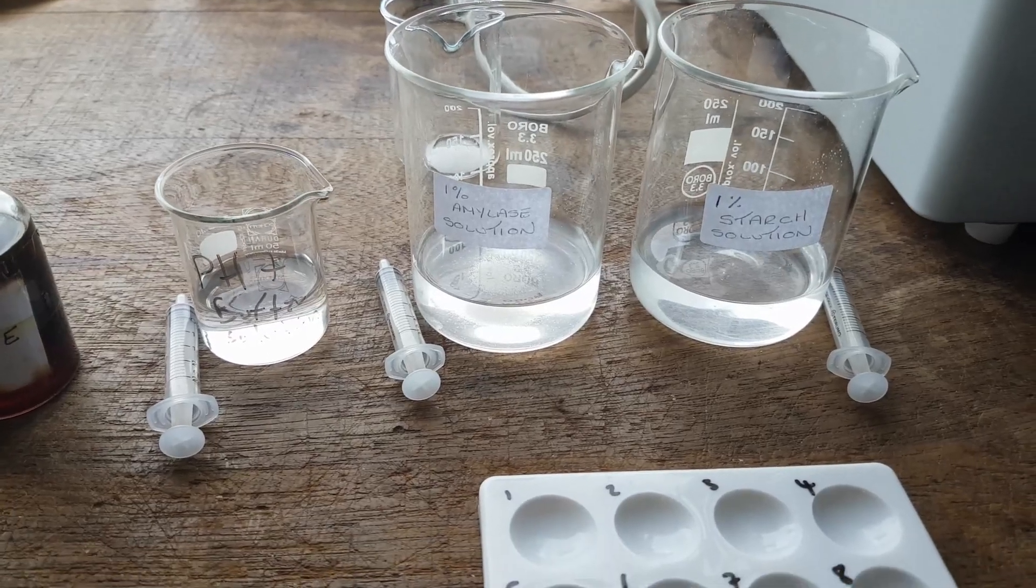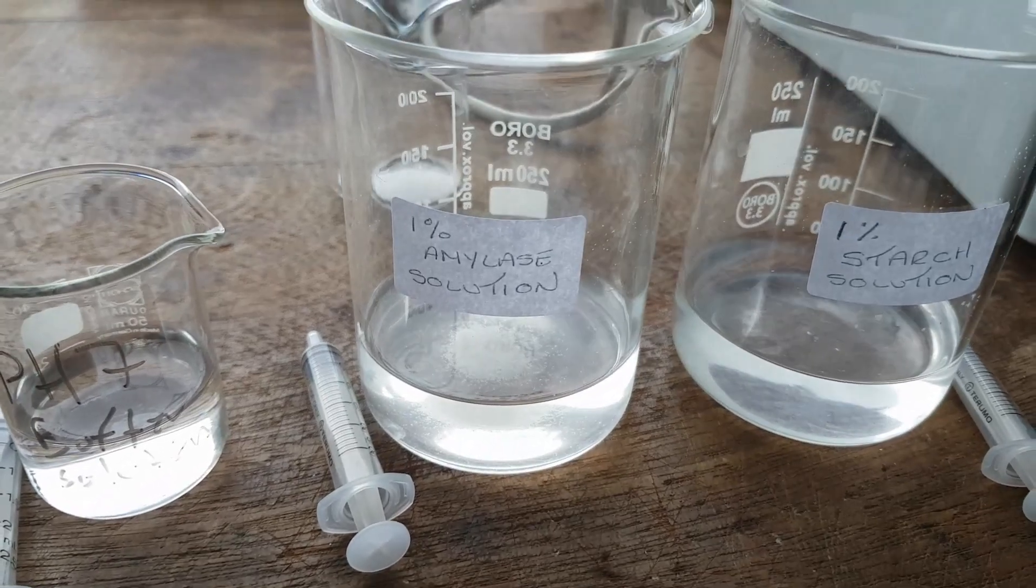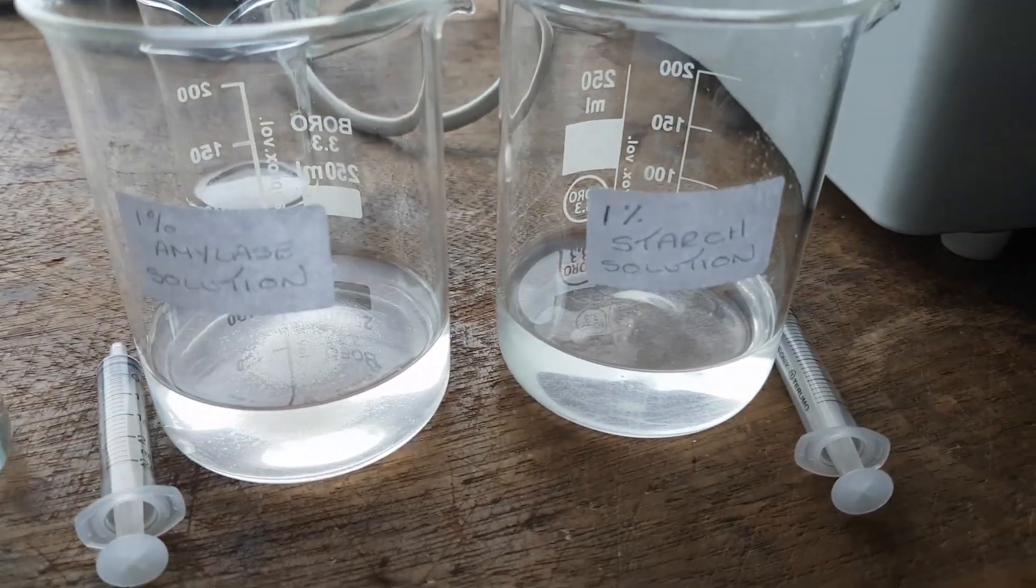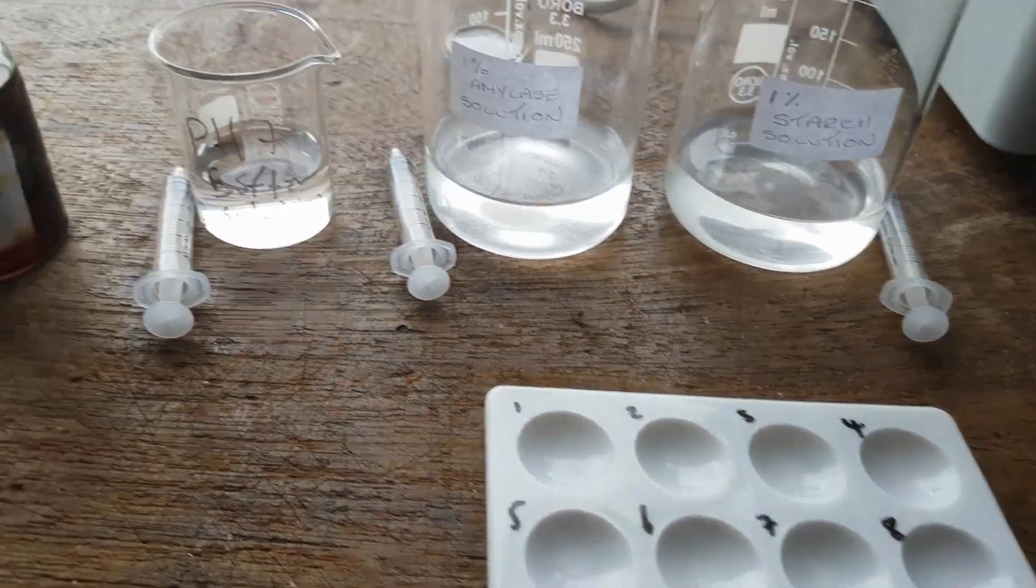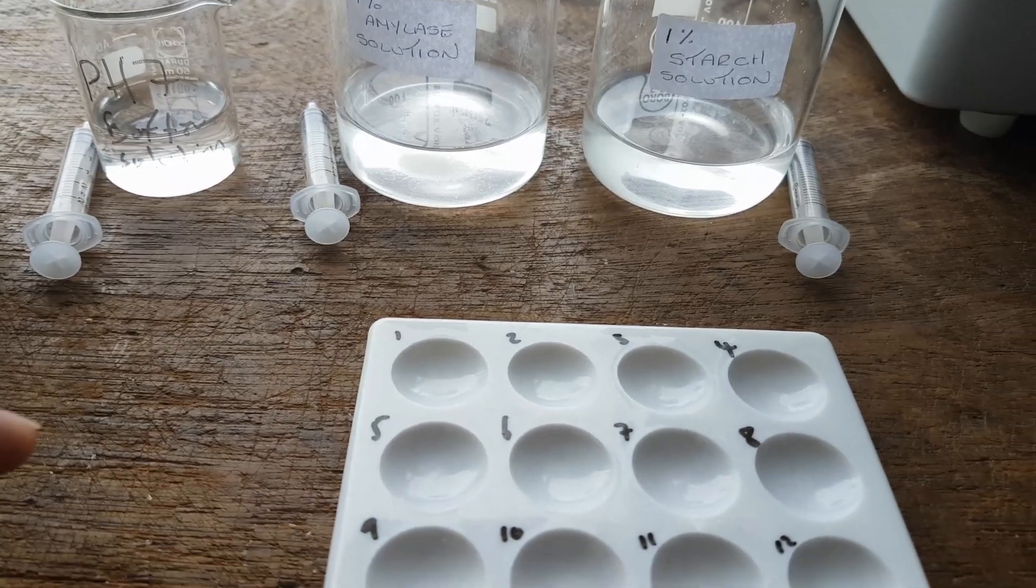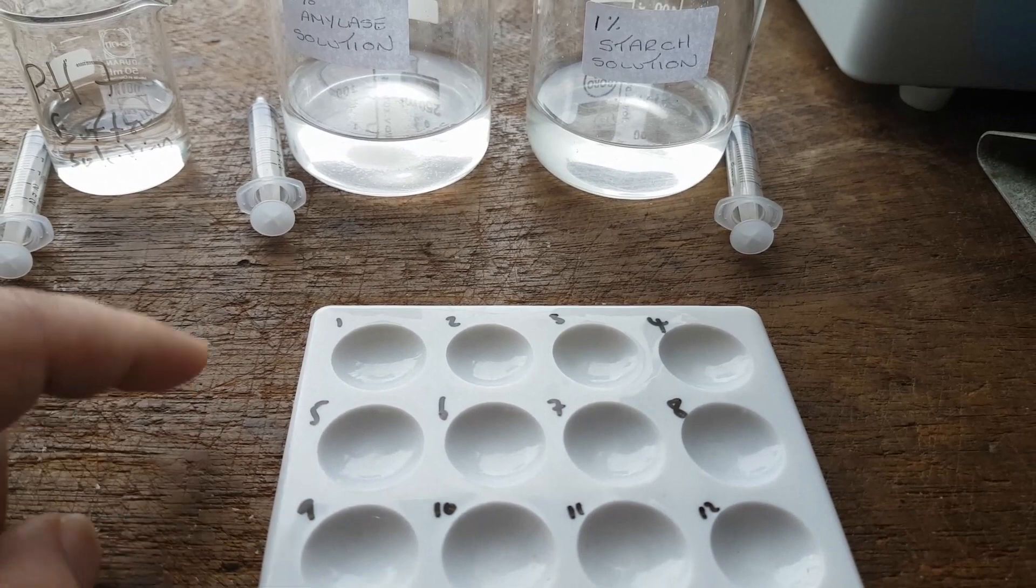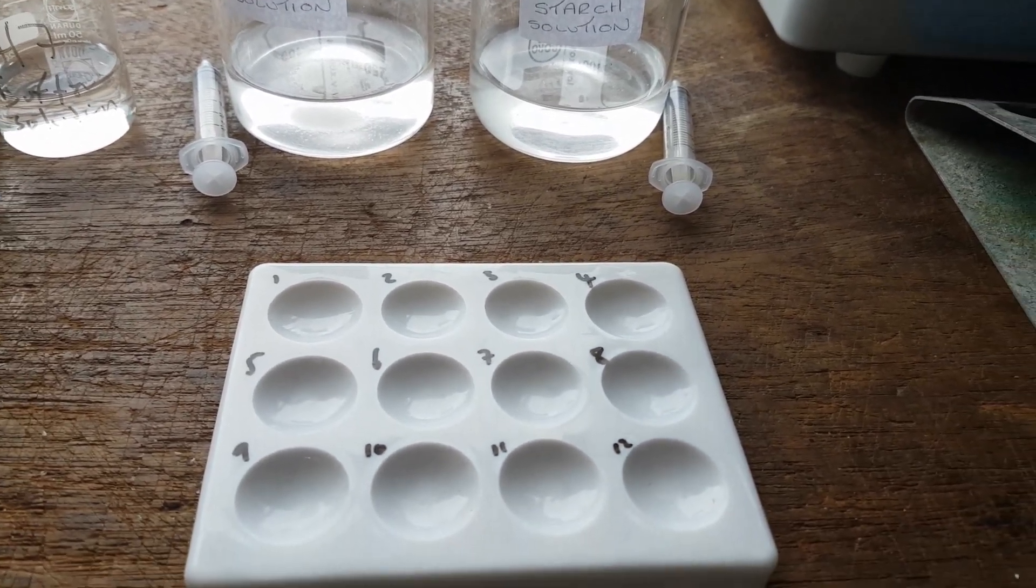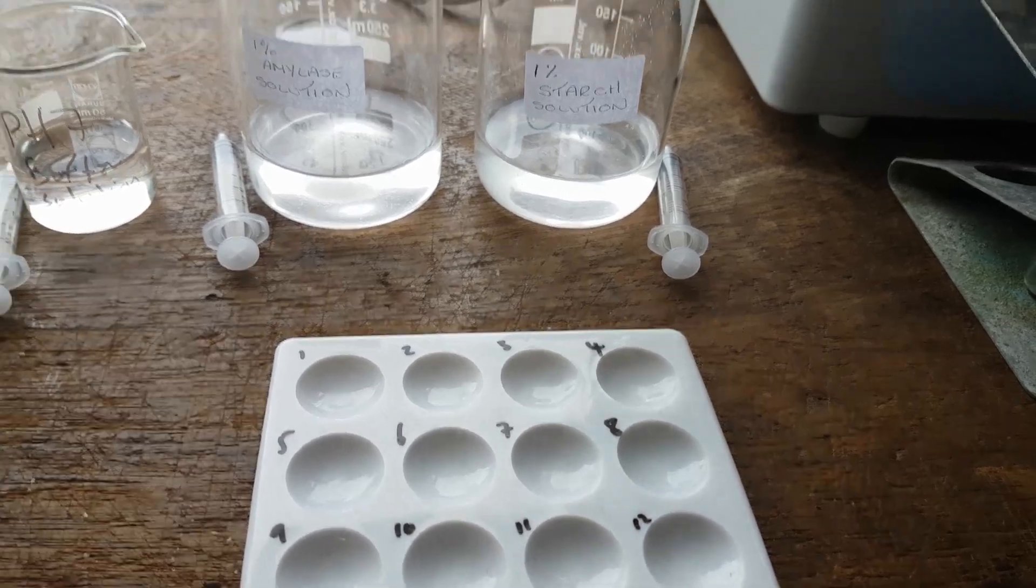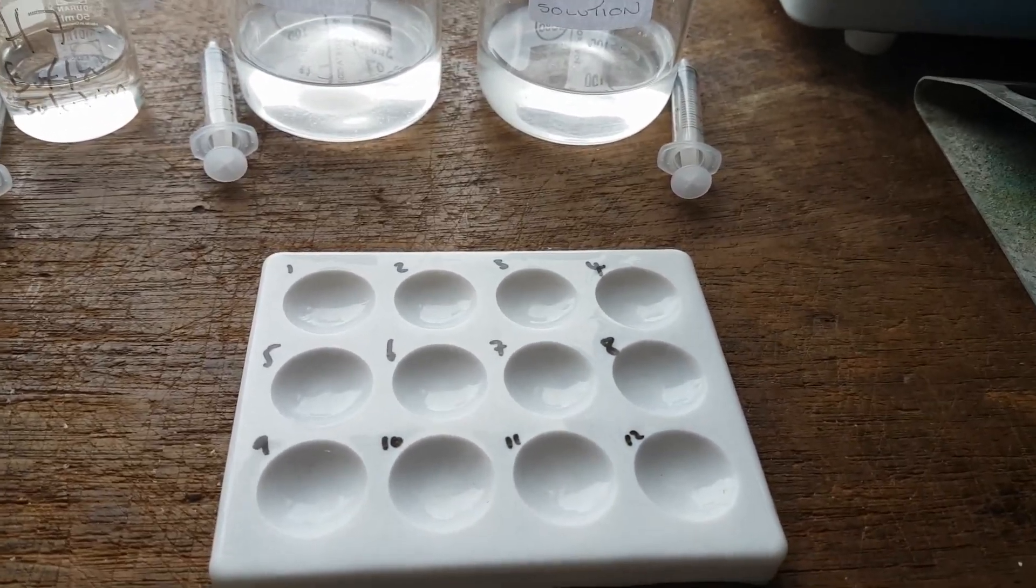So the idea behind this experiment is the amylase solution, the enzyme, will break down the starch. We're going to test how long it takes to break it down when we're changing the pH. What we expect eventually over time is that the iodine will turn blue-black until all the starch has been used up and converted into sugar by the amylase solution. Then there will be no color change.